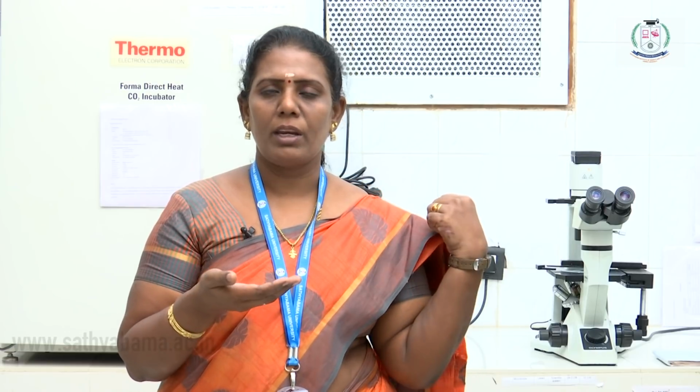Inverted means the light is coming from the top, and we are able to magnify our cells of interest which are present in the flask, and we can easily view them. That is called the inverted microscope, or another name for this is the light microscope.